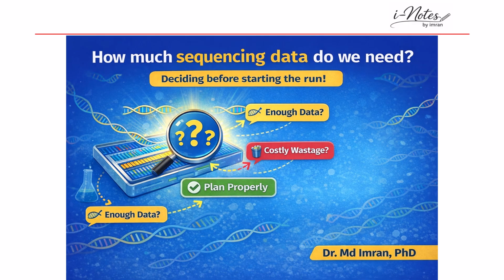So planning is very important, and for planning, we have to take care of several things, and one of the most important things is how much sequencing data do we need. This we have to decide before starting the run.